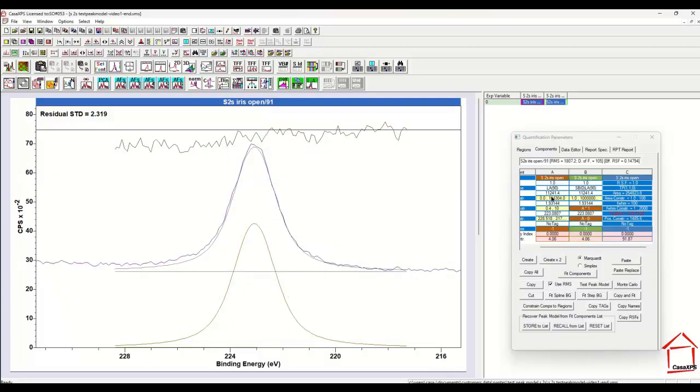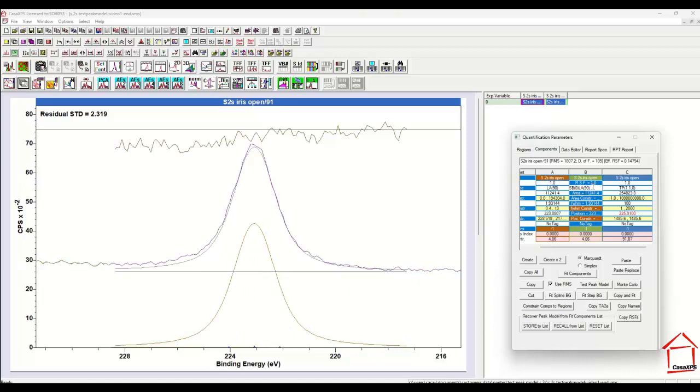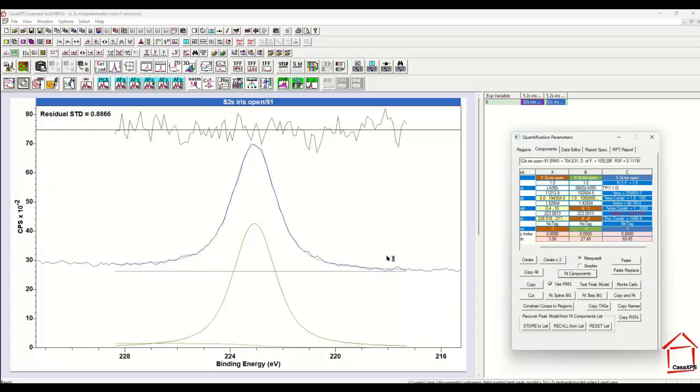So we've got 3 components now. The first is the photoemission peak that represents a Lorentzian line shape, a Shirley background that is calculated from the line shape that we use for the photoemission peak, and then this linear form that will help the fit. So now when I say fit, I end up with a comparable fit to what I had before, and the only difference is that I don't need to manually adjust the start and end offset in order to achieve a fit to the data.